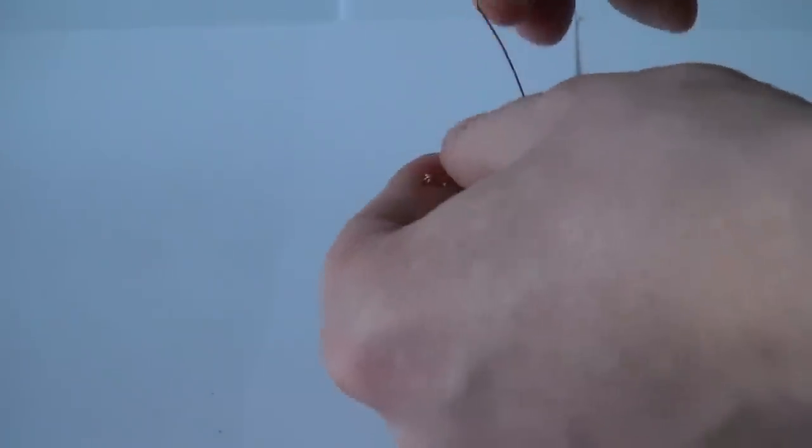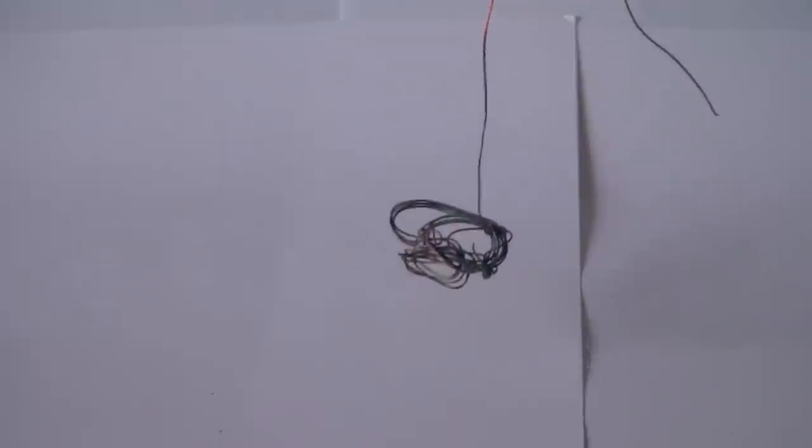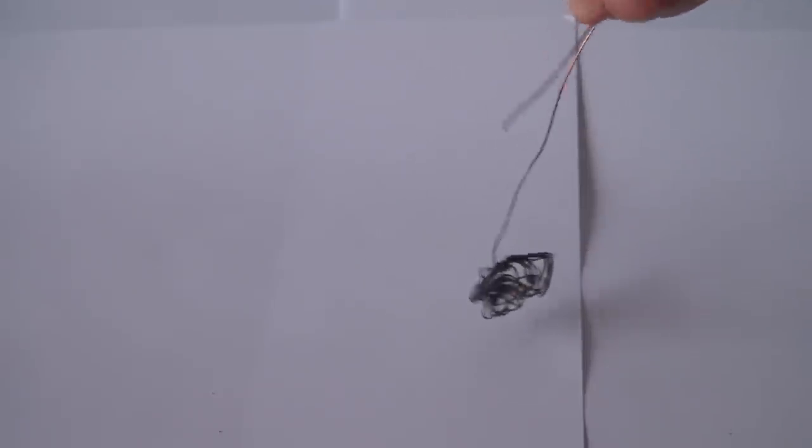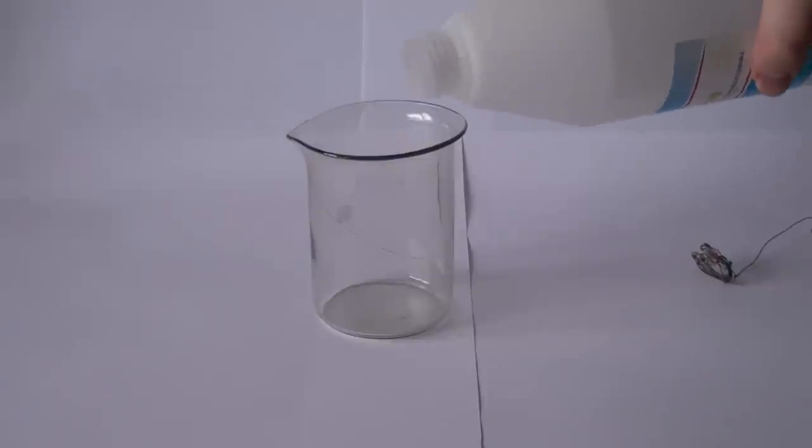Furthermore, the resulting coil of wire must be burned to get rid of the thin polymer layer. Once you have prepared the copper wire, pour a little bit of acetone into a beaker.